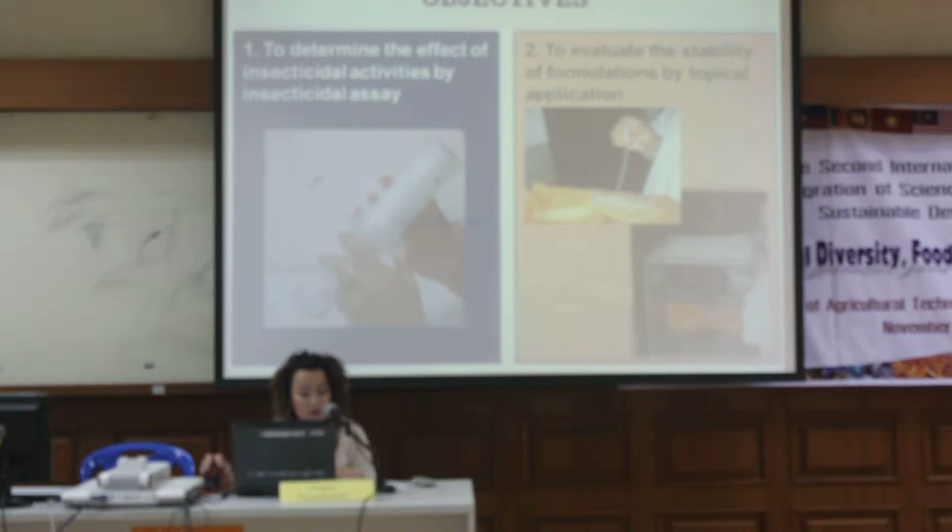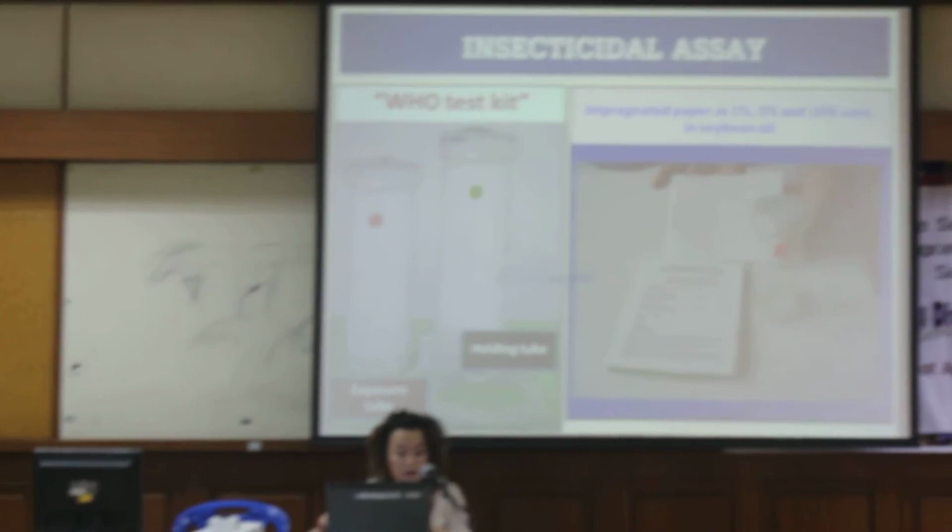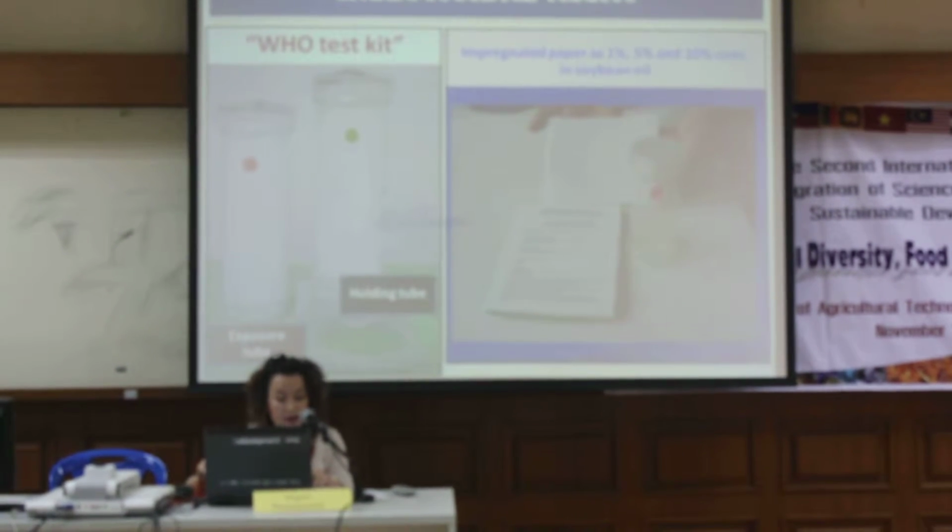temperature and time interval, and also tested by topical application. So I will start the first experiment. This slide shows you the technique of insecticidal susceptibility assay.